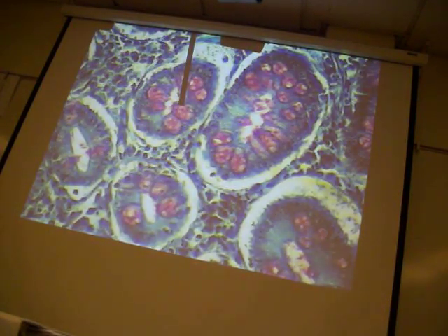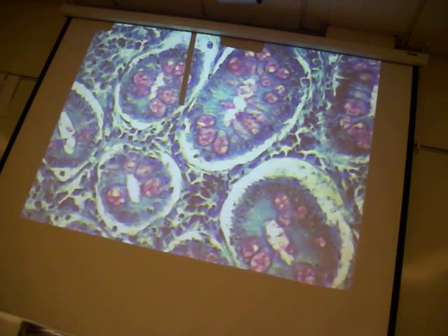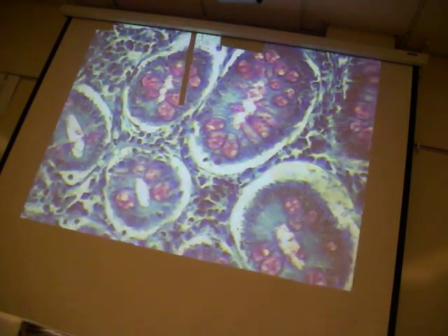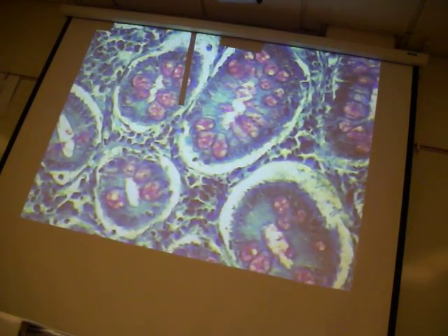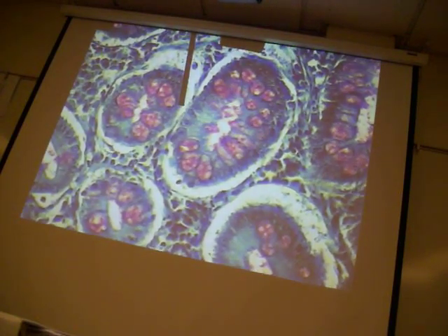Just one nucleus. Is that the structure of the whole cell? That's a portion of the cell. Like that oval? Yep, that's a portion of it. The nucleus is right there. There's the nucleus right there. Everybody feel pretty comfortable with that one? Alright, so now just to show you guys a goblet cell that's not stained.